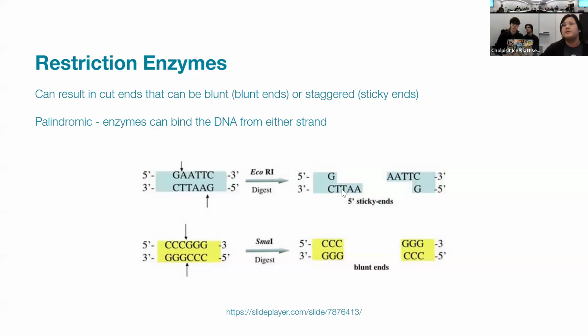Before we get into the gel, if we have some starting DNA and we want to do some modification to them, one simple task that we can do, and it's technically the first technology that we have in the genetic engineering world, is actually the restriction enzymes. The enzyme is something that can work biochemically, right? The restriction means something that restricts their target to something specific. And in this case, it is a restriction endonuclease, where it's going to find the DNA that has this sequence, GAATTC. If it finds this DNA sequence, it's going to cut it.